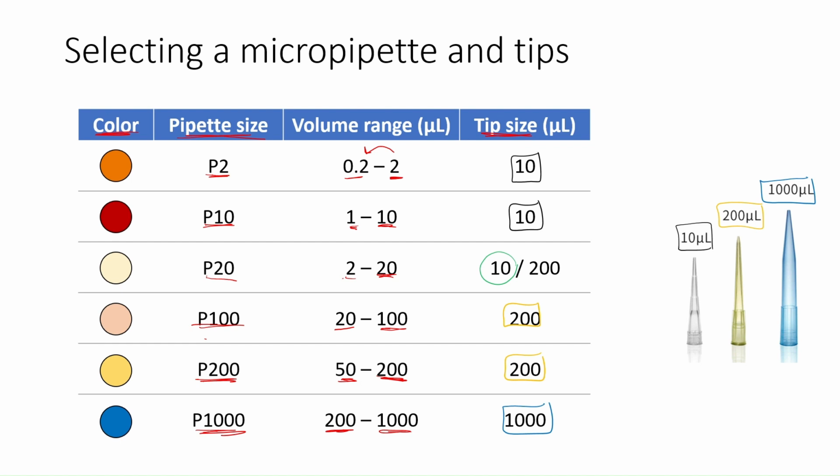If you're using larger volumes, between 10 and 20 microliters, you'll need to use a 200 microliter tip, because you never, ever want to try to put more than 10 microliters of liquid into a 10 microliter tip. So since this is a P20, your 1 to 10 microliters can go in the smaller tip, but your larger volumes will have to be measured in that larger tip.